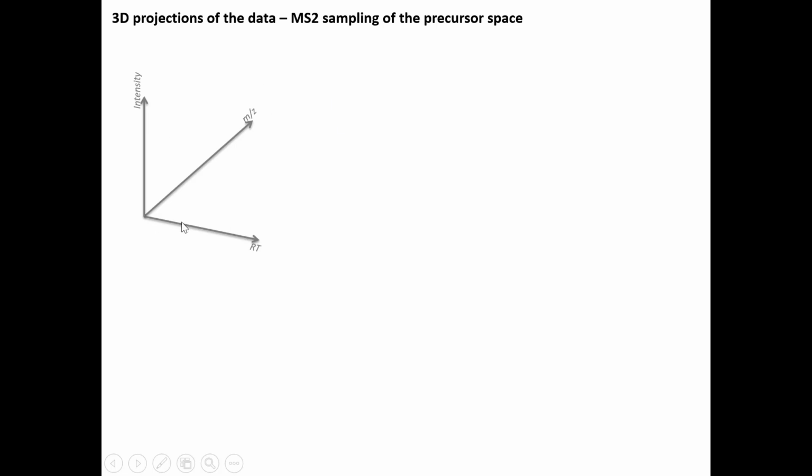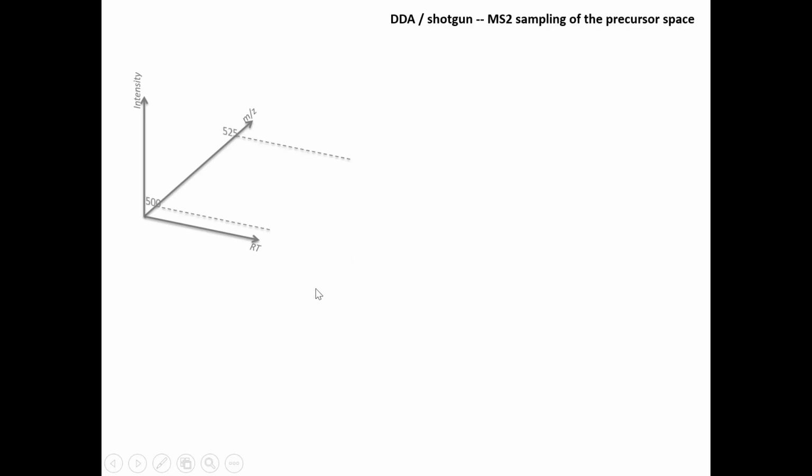The projections are these 3 dimensions that we're always talking about in mass spectrometry: the mass to charge dimension, the intensity dimension, and a chromatographic dimension, retention time. From one projection you see a mass spectrum, m/z versus intensity. From another projection you see the chromatographic projection, like extracted ion chromatograms, but you can also project this in 3 dimensions.